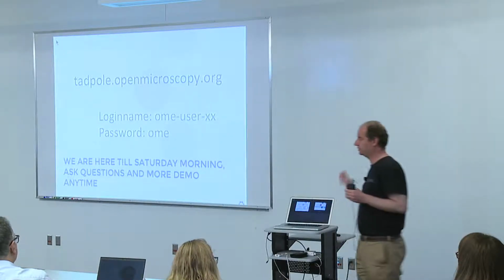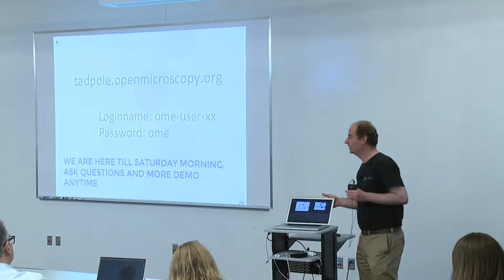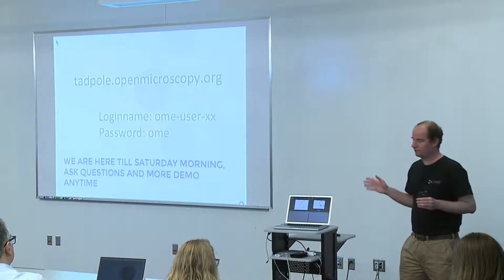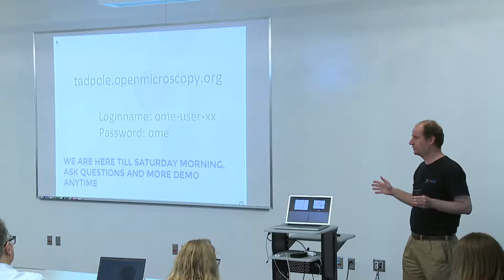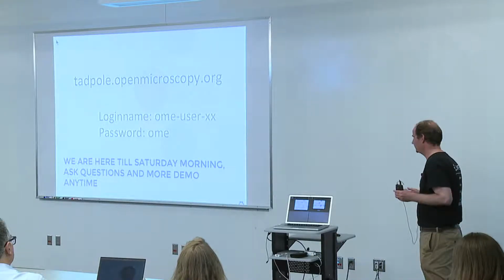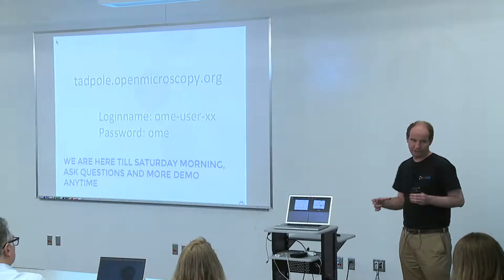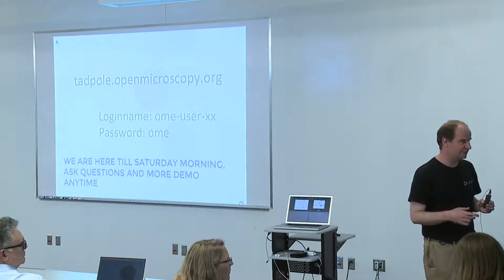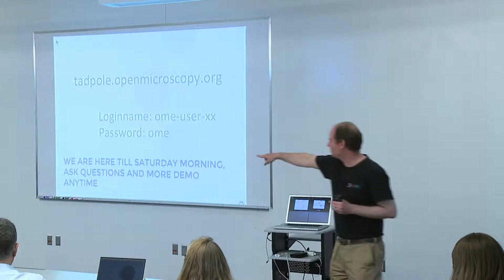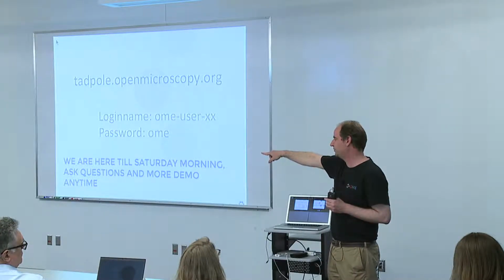Now let's go to the setup, because this will be a little bit harder part. It's made easy. I said that OMERO is a server-client application. We have a server, we call it tadpole. You can call it whatever you like, but in this case, this box we brought with us with our own network is called tadpole. The tadpole box, the server, is where, Dominik? It's just there. This is the small box which is on the table there. That's the server. All the data you have is on the server.